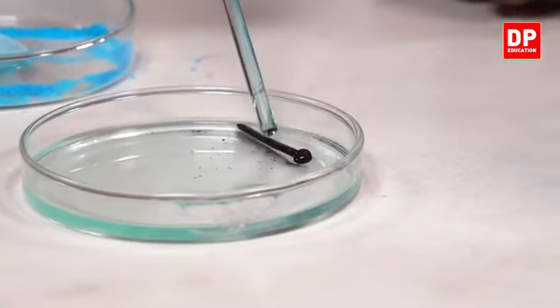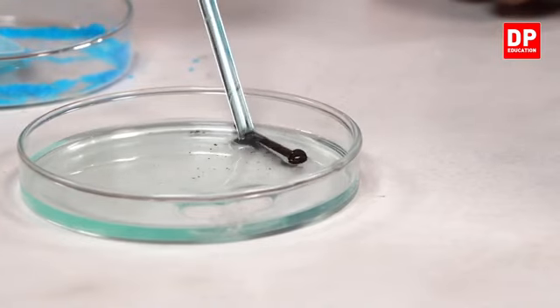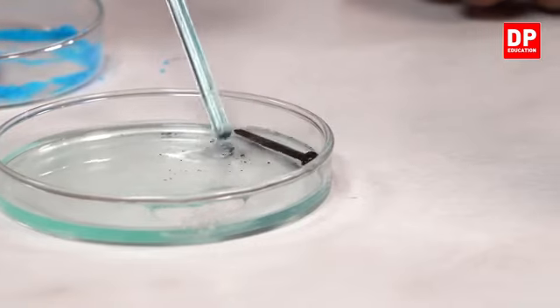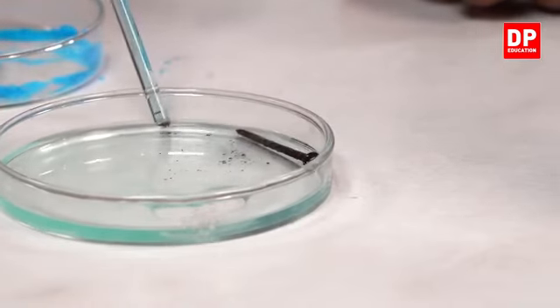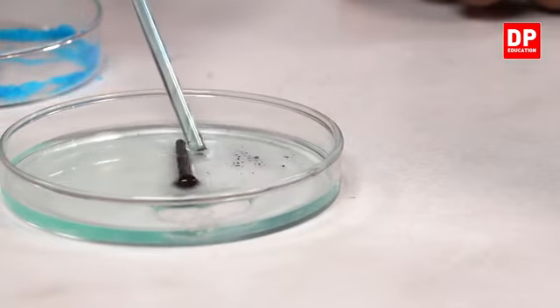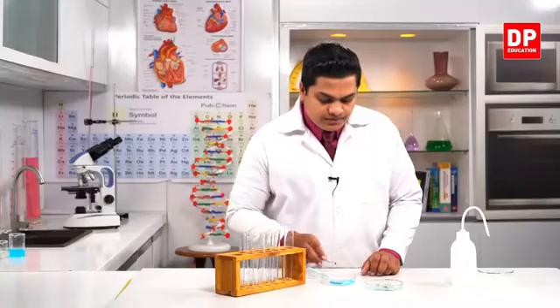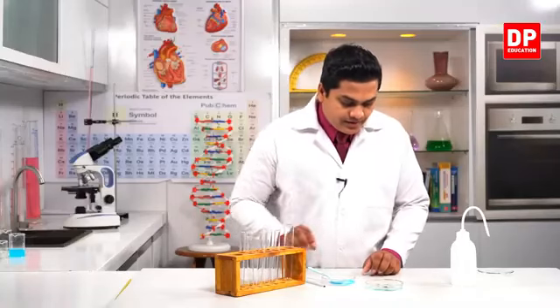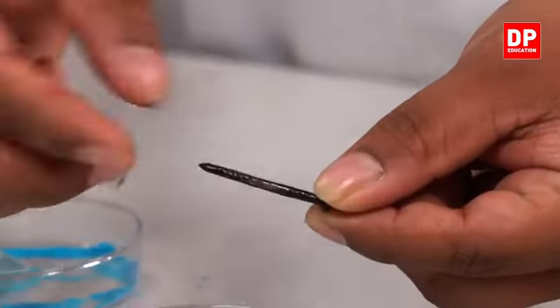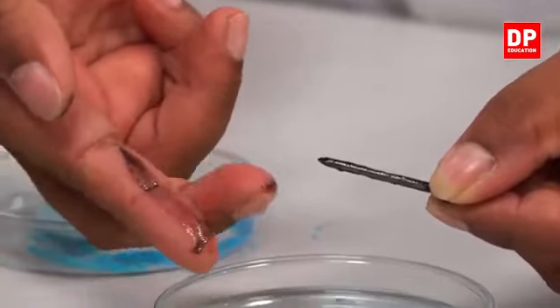See? There is a substance around the iron nail and it's like a powder. You can see that powder in here, within the liquid, within the copper sulfate solution. Right. So I'm going to take it to my hand. Let's see. See that powder?